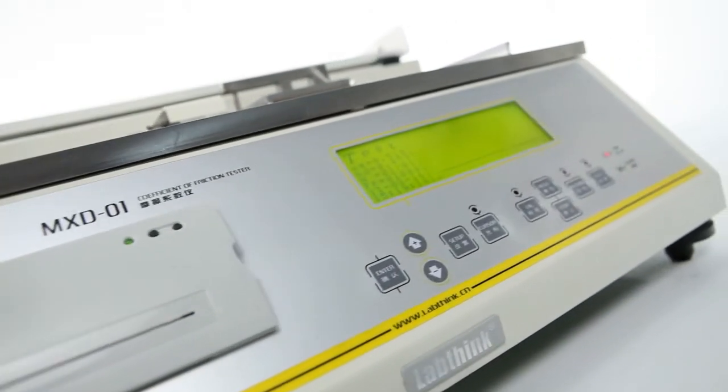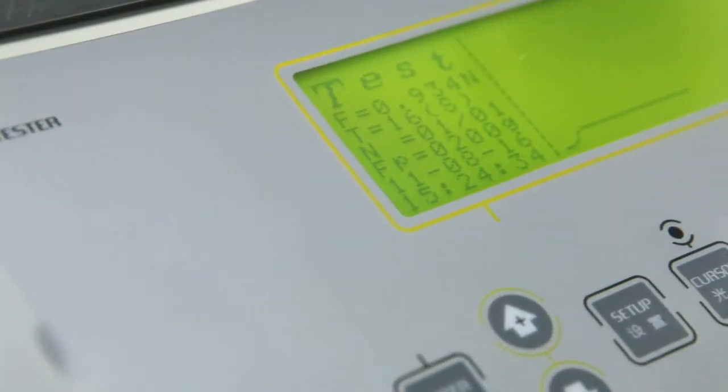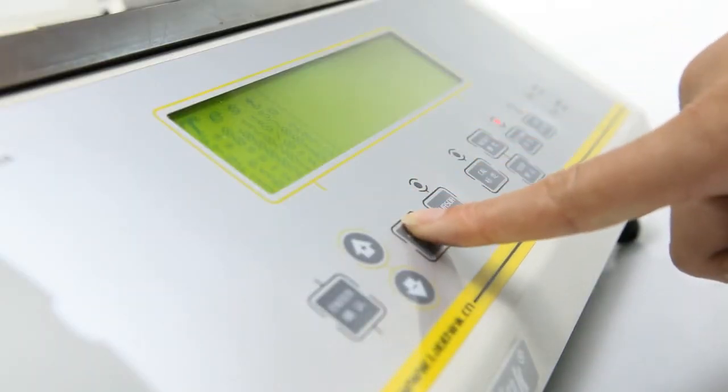Being integrated with the tester, the PVC operation panel, the mini printer, and the LCD display can show the real-time testing results and final graphs.